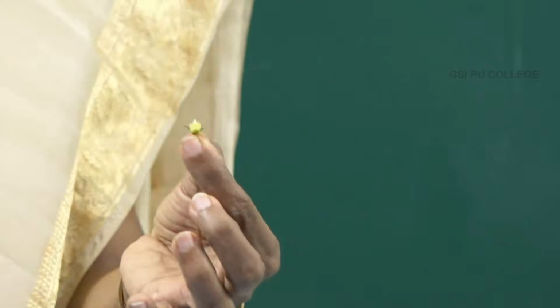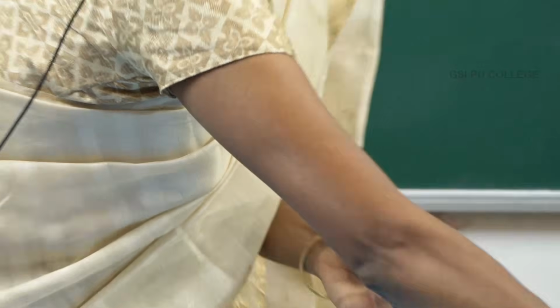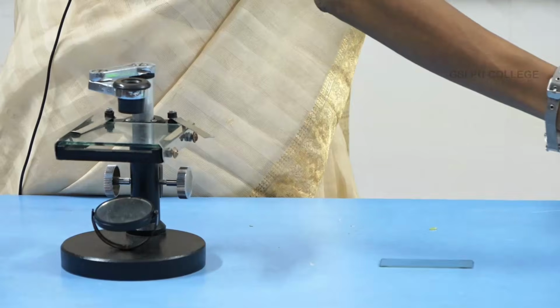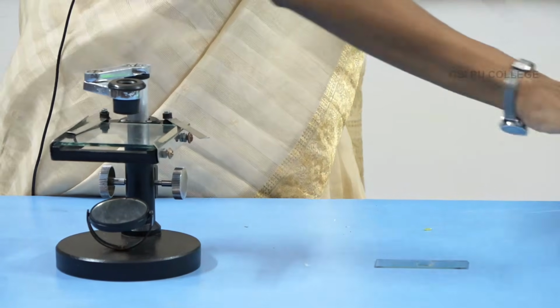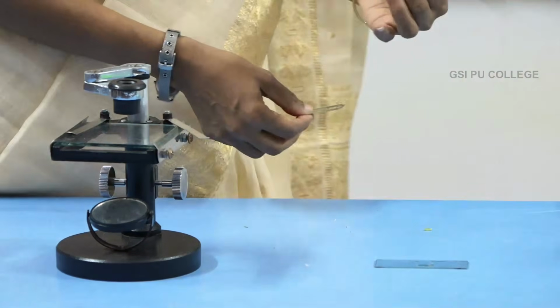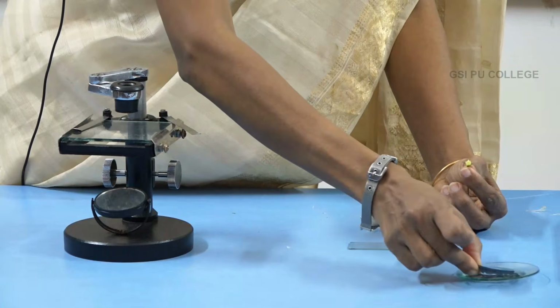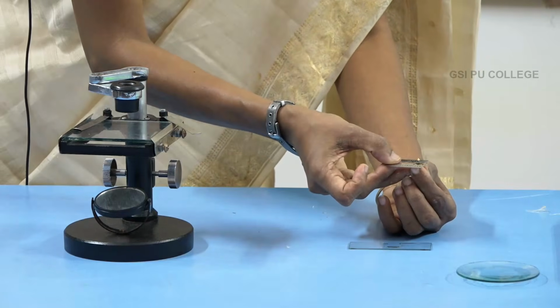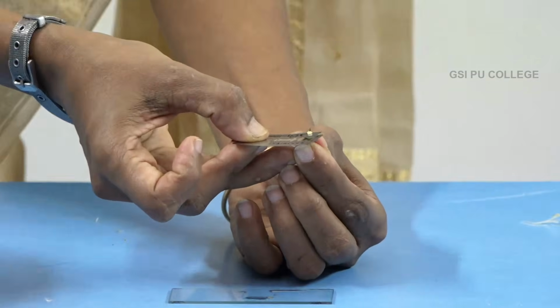This is the ovary. What you have to do is take a transverse section. Take a glass slide, add 1 drop of water, and then take a transverse section of the ovary like this. The blade is dipped like this in order to avoid air bubbles, and hold it like this, and then take the transverse section.